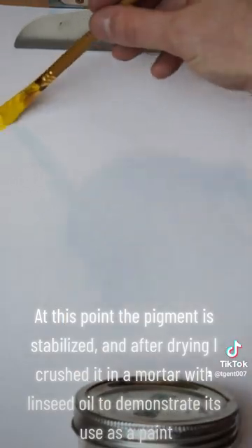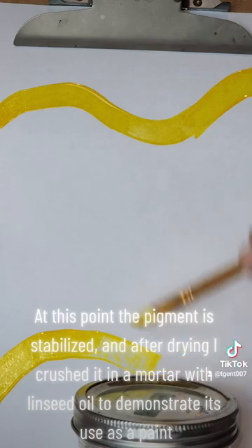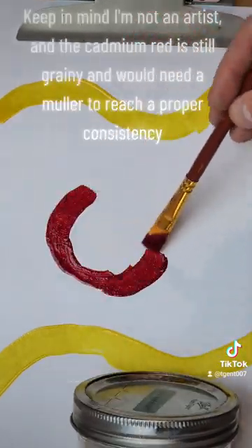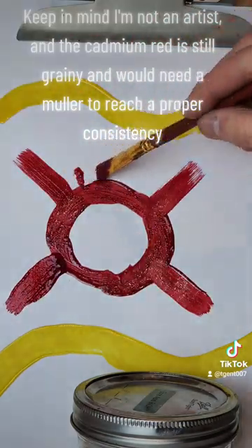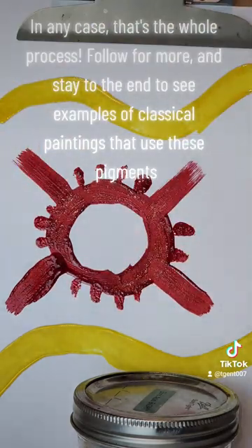At this point, the pigment is stabilized, and after drying, I crushed it in a mortar with linseed oil to demonstrate its use as a paint. Keep in mind I'm not an artist, and the cadmium red is still grainy and would need a muller to reach a proper consistency. In any case, that's the whole process.